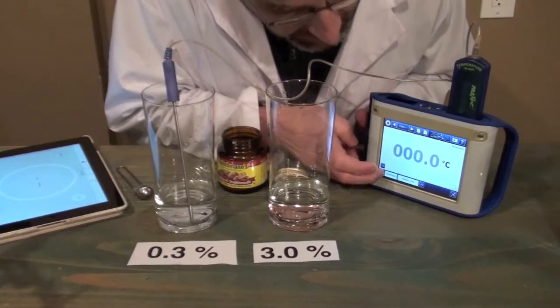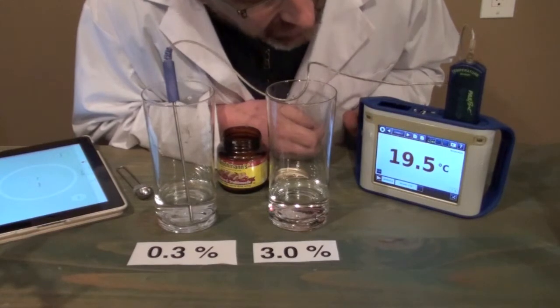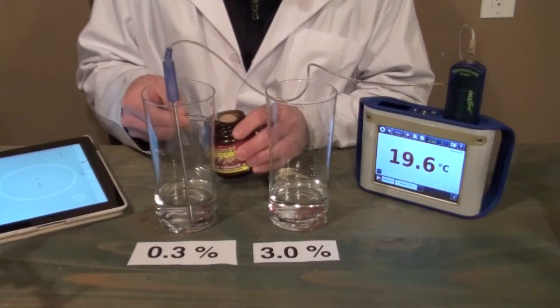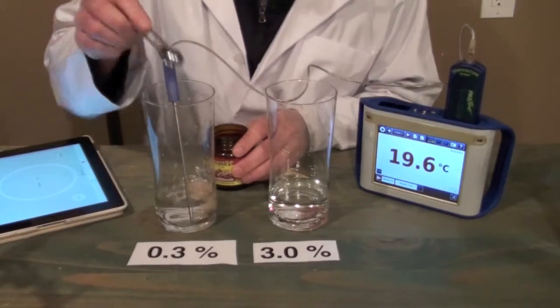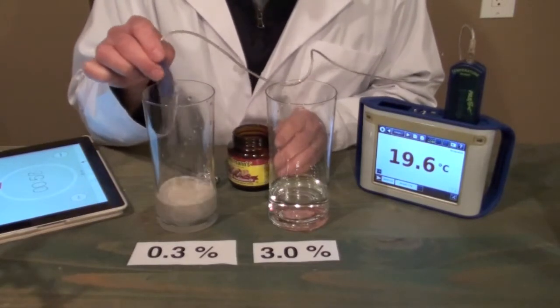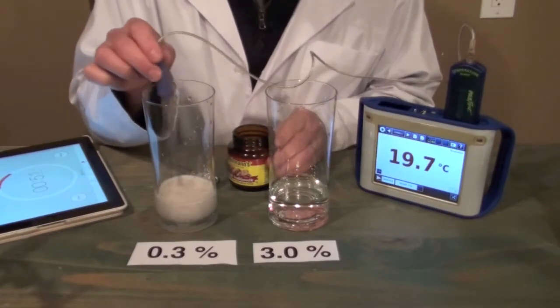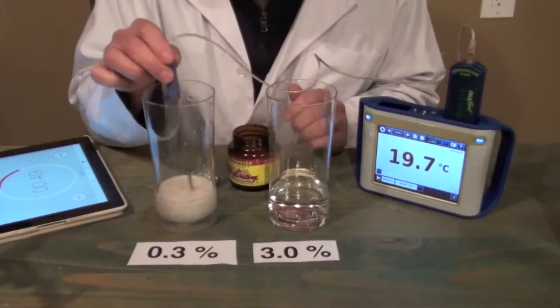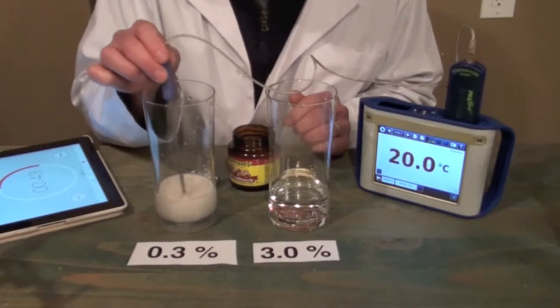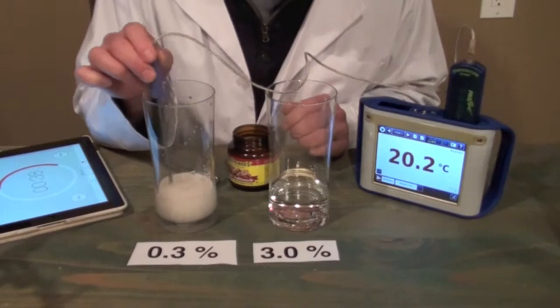And let's get this started. And we see that the temperature is 19.5 degrees. So we'll add our 2.5 milliliters of yeast, hit the timer, and then we will stir gently and see what happens. Well, if we look at our container closely, we'll see that there are some small bubbles forming inside. And after about 20 seconds, it looks like we have about a centimeter of bubbles in there.